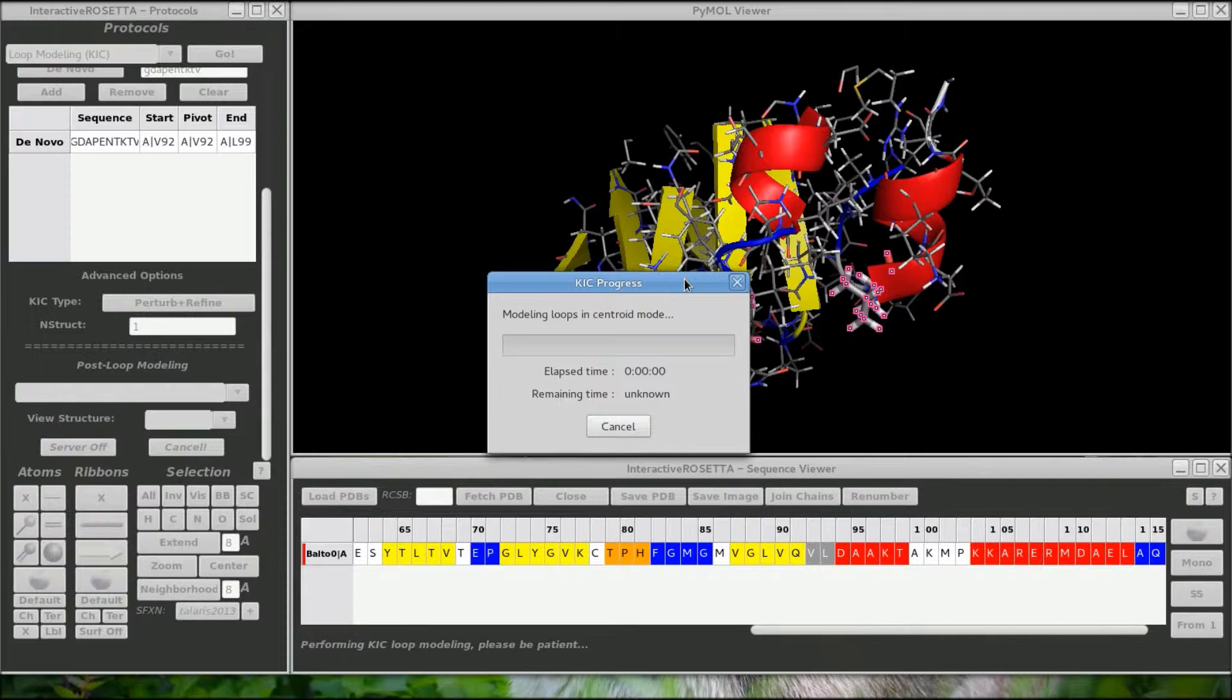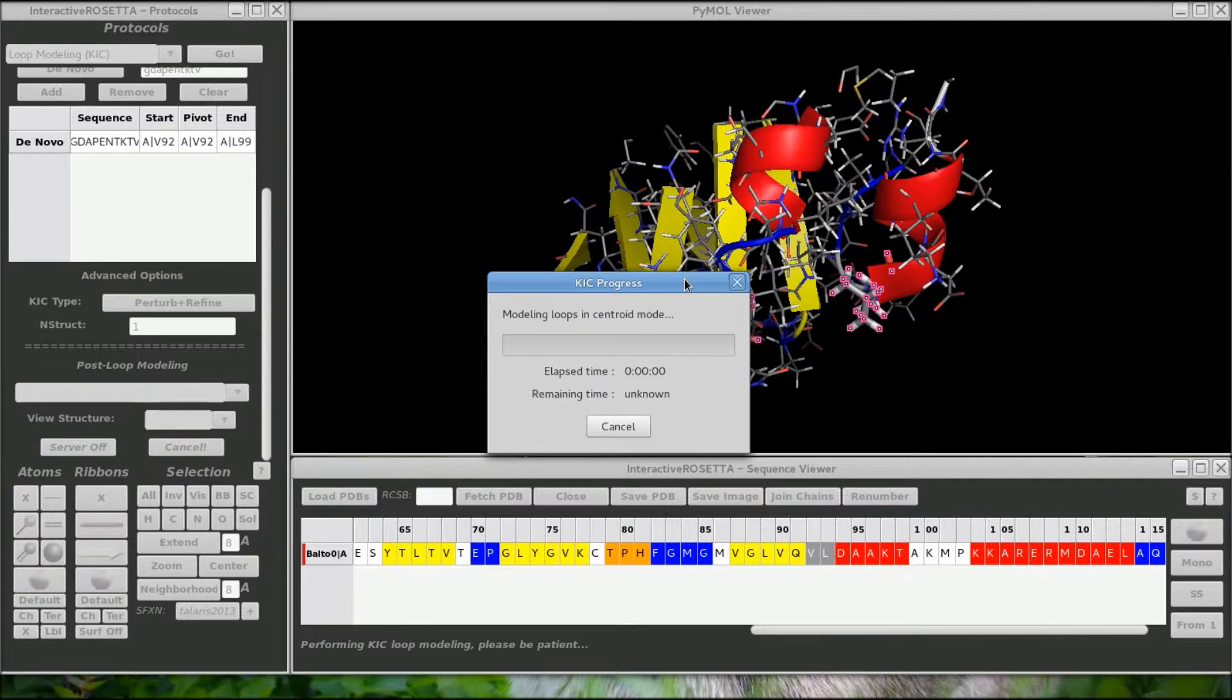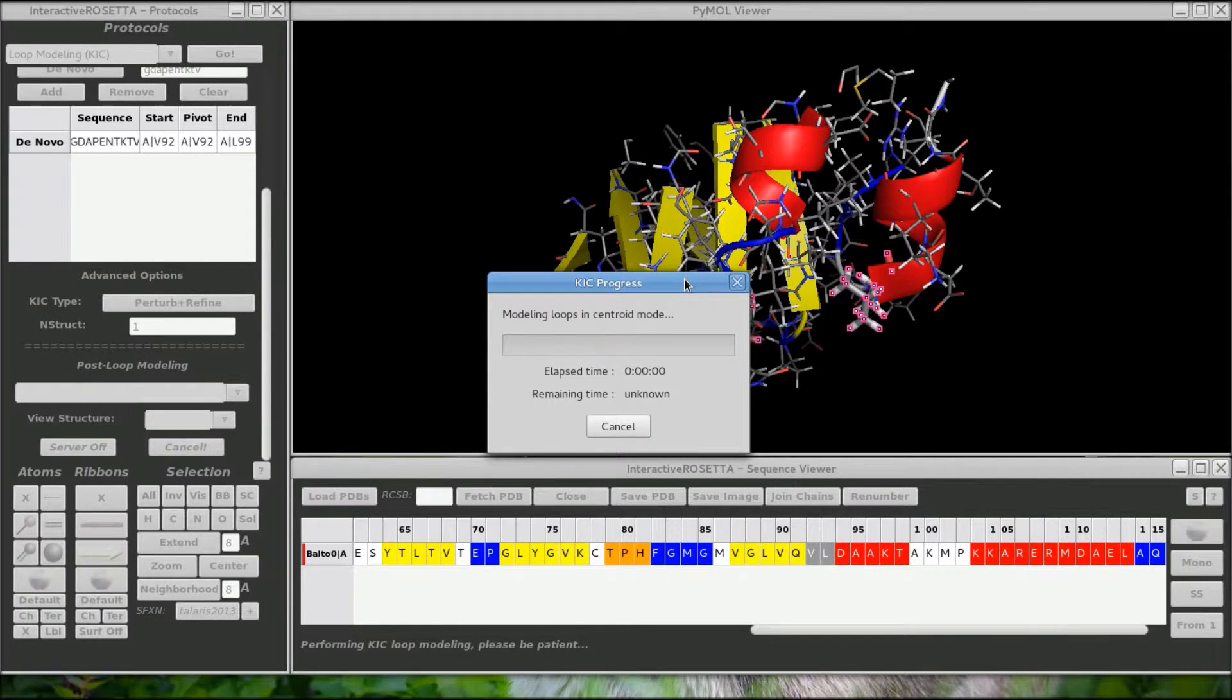It performs the low resolution kick step first but there is no progress information for low resolution mode, so you have to wait a bit until high resolution kick modeling starts and the progress bar begins to receive information.